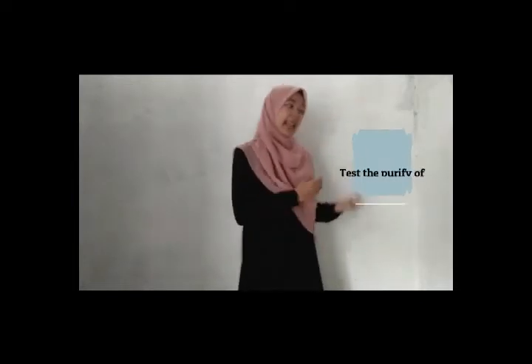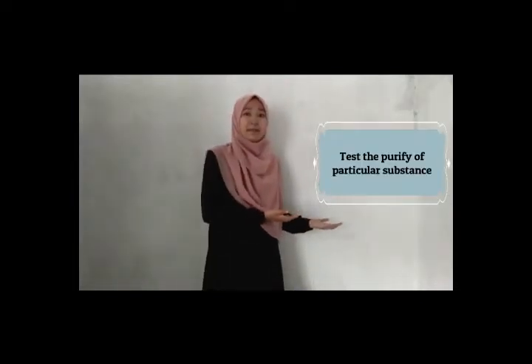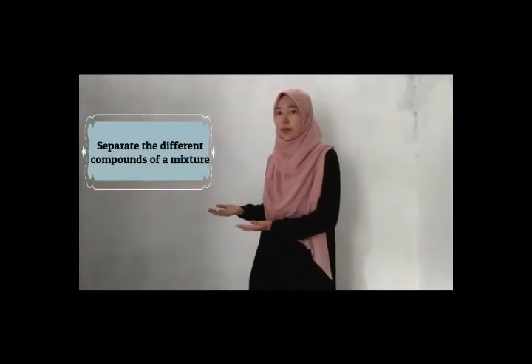Function of gas chromatography. Gas chromatography is used in analytical chemistry for separating and analyzing compounds that can be vaporized without decomposition. For example, we can test the purity of a particular substance, and we can separate the different compounds of a mixture.